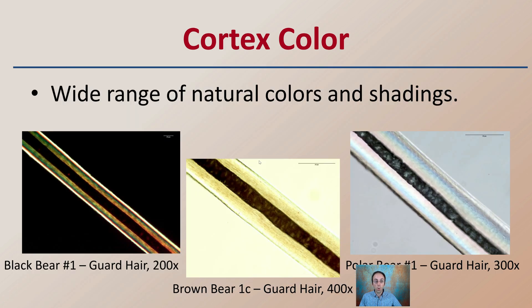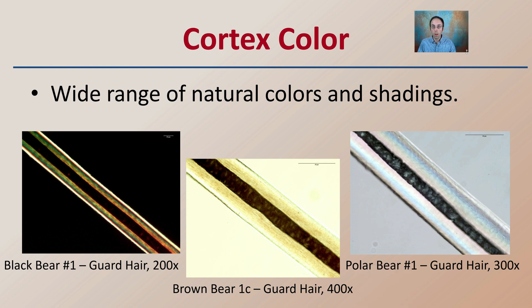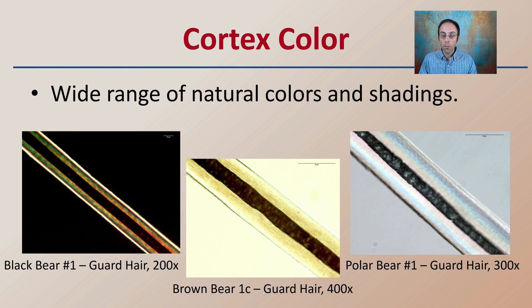Moving on to cortex color — there's a wide range of natural colors and shadings that occur. Looking at guard hairs of a black bear, a brown bear, and a polar bear, we can see the differences in cortex color and shadings clearly in those samples.